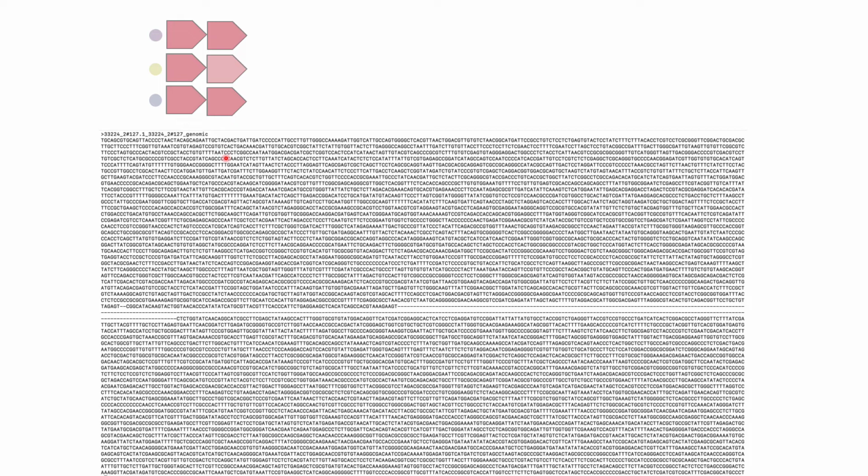It's just some A's, G's, C's and T's. We can see here that there are some dashes. That means that there's a misalignment somewhere. So this is only the first sequence in the alignment. And then as we go down through the different genomes that we've included, some of the genomes will have bases here where there are gaps.